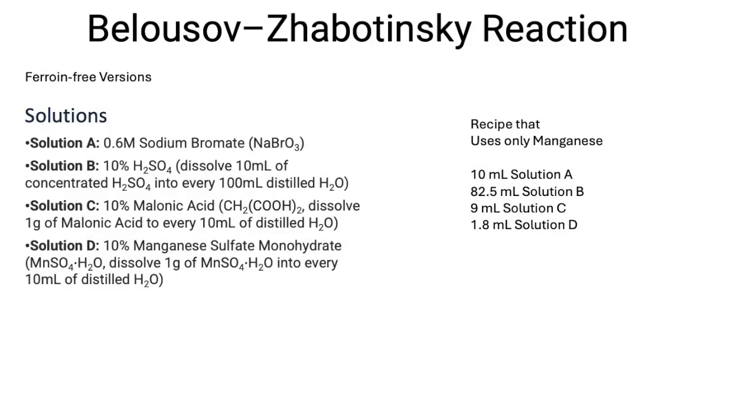Inspired by this approach, I've developed a slightly modified procedure. Instead of adding solids to the reaction mixture directly, I've made a change that allows for the addition of multiple solutions containing an equivalent amount of each reactant. This modification makes it easier to manage this reaction. Pause here if you'd like to take notes of the recipe.